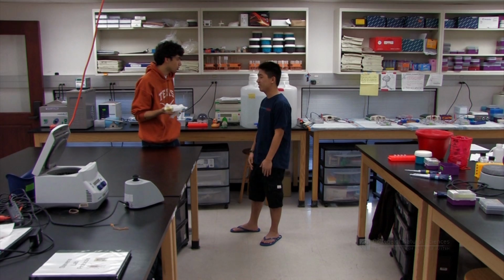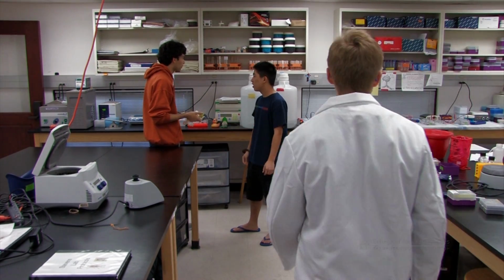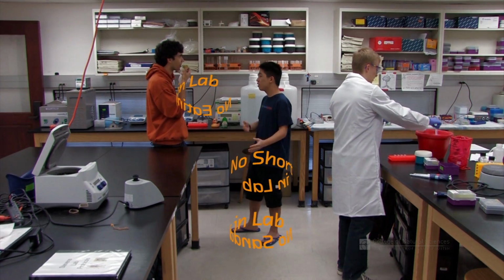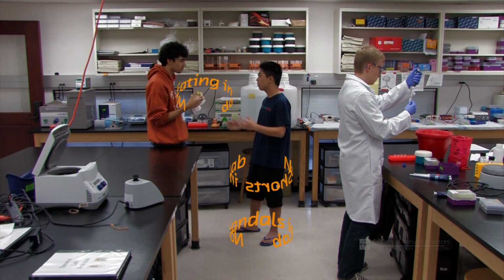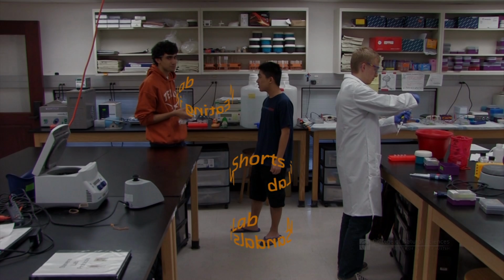It is important to be aware of others working around you in the lab and to use safe practices even if you're not setting up experiments yourself. You can be injured by someone else's experiment when you least expect it. Be sure to wear proper safety attire whenever you're moving around the lab, even if you're just chatting or asking your instructor a question.